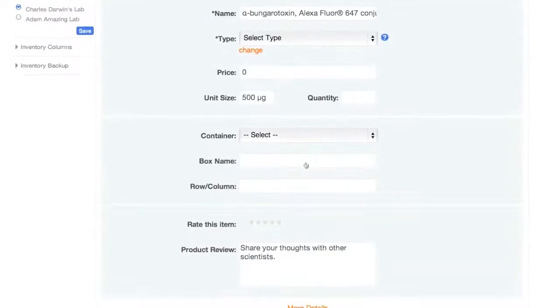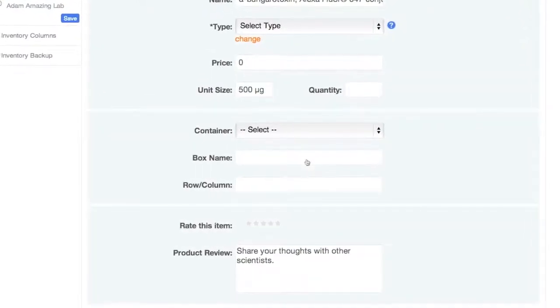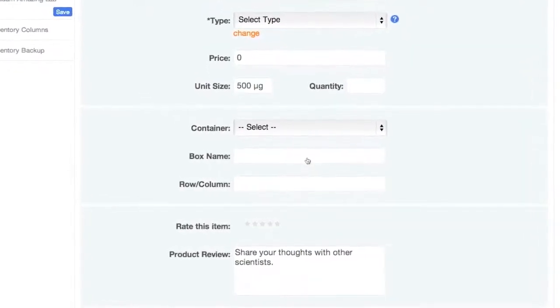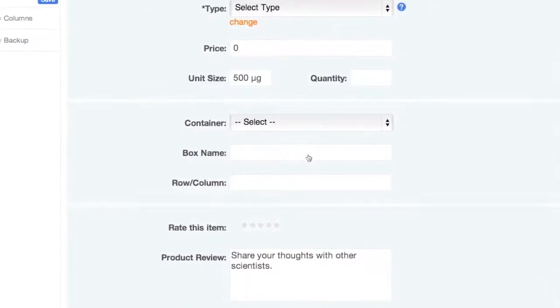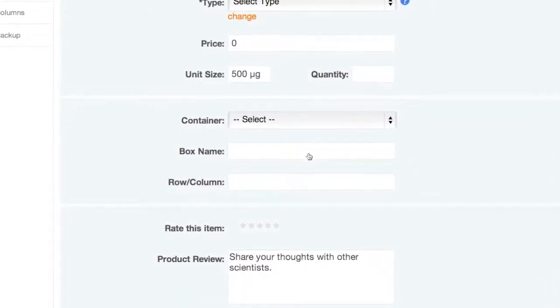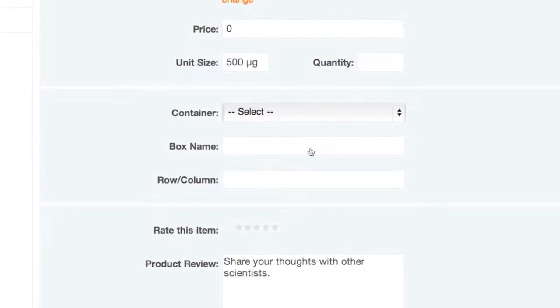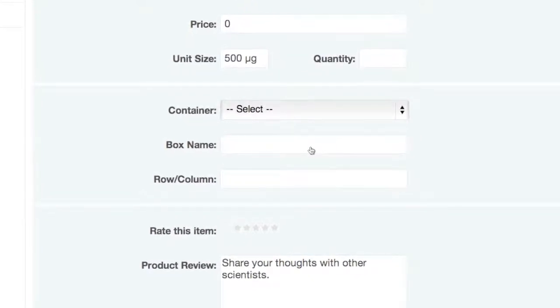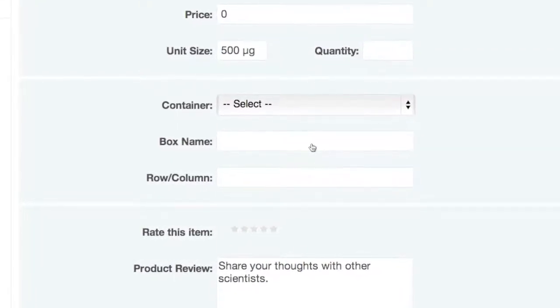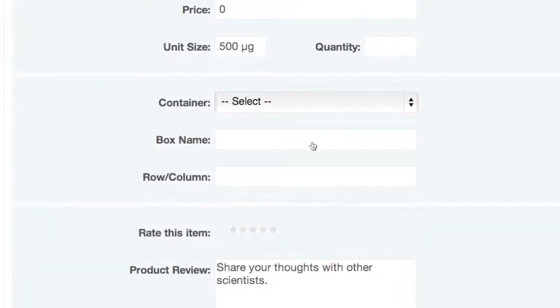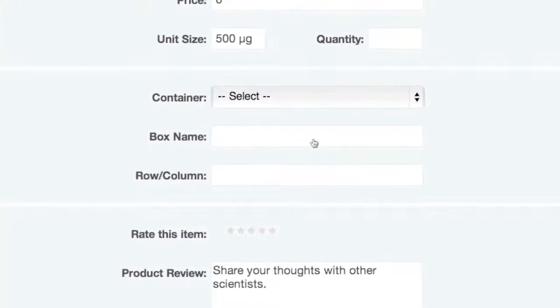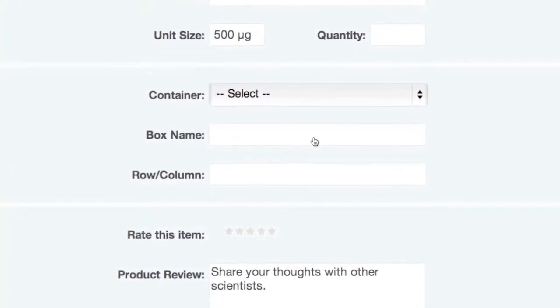Now let's talk about location tracking. On Quartsy, there are three location categories: container, box, and row/column. But you can use them to mean whatever you want. For example, some Quartsy users use container to mean room and box to mean shelf. Container is the broadest location field and appears in the inventory filters.